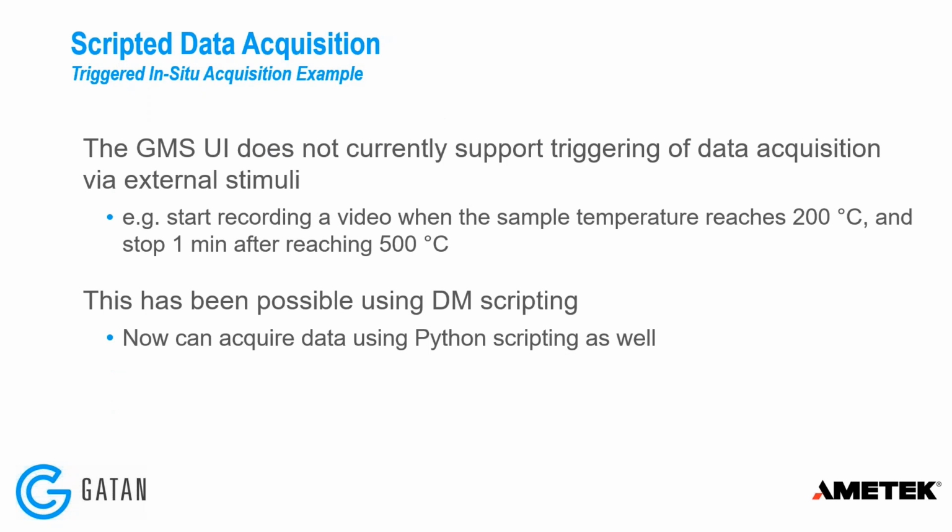The next example that I want to talk about, although I don't even have a script written for this yet, but I'm excited about the possibilities for triggered data acquisition. The current user interface in GMS really doesn't support triggering of data acquisition using some external stimulus.